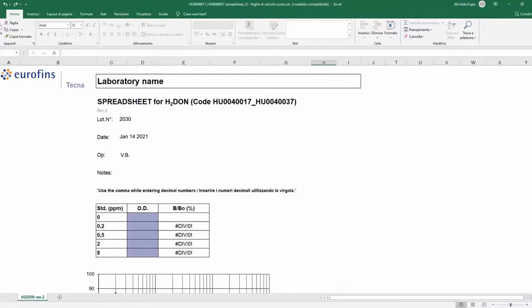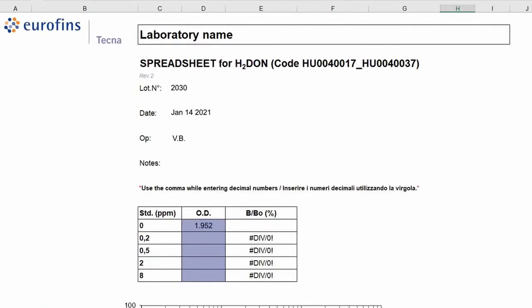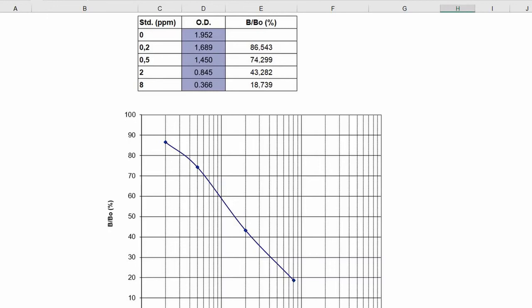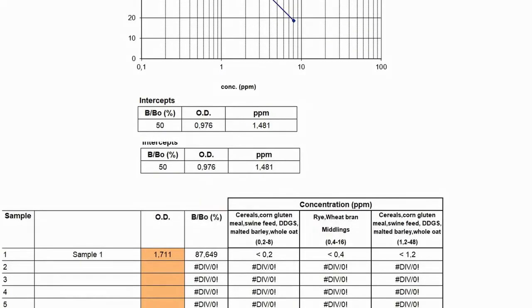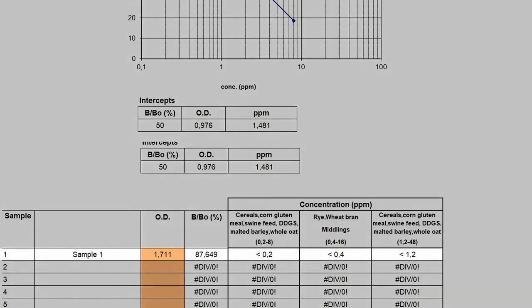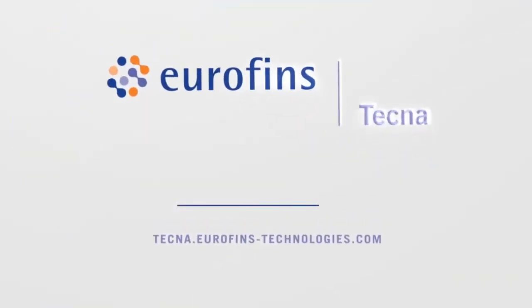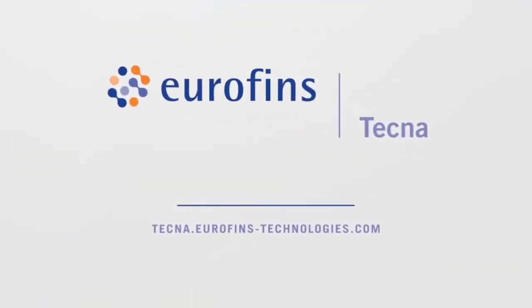Download from our website the dedicated spreadsheet. Copy the absorbances measured for each standard in the upper part of the Excel and those of the samples in the dedicated table. Concentrations are automatically calculated taking into account the sample dilution factor.